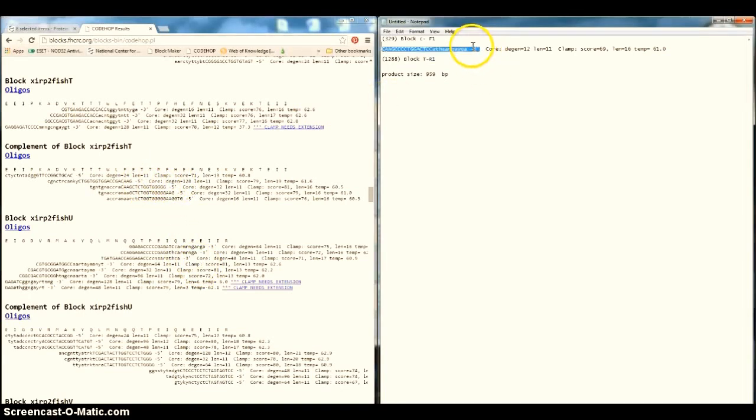You see, here's the 3 ending, and it should be the 5 ending. So let's again check the degeneracy. See, the first one is 24, and it's quite high, and 32, and 16. So you see the lowest one is 16.